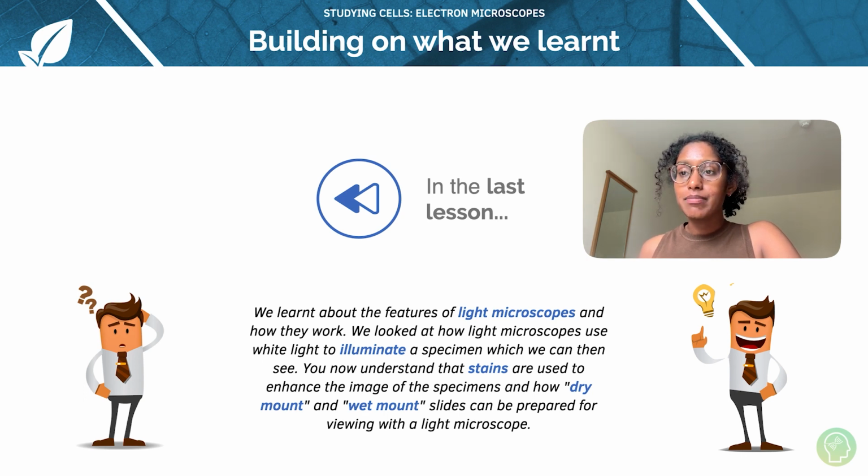We looked at how light microscopes use white light to illuminate a specimen which we can then see. You now understand that stains are used to enhance the image of the specimens and how dry mount and wet mount slides can be prepared for viewing with a light microscope.